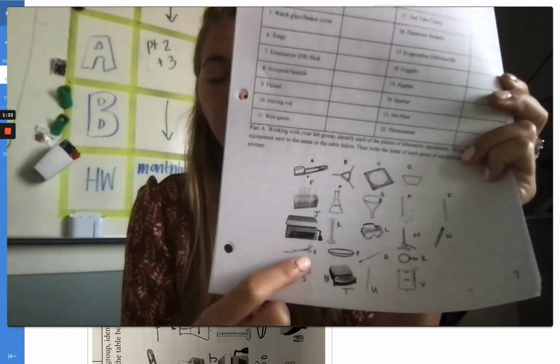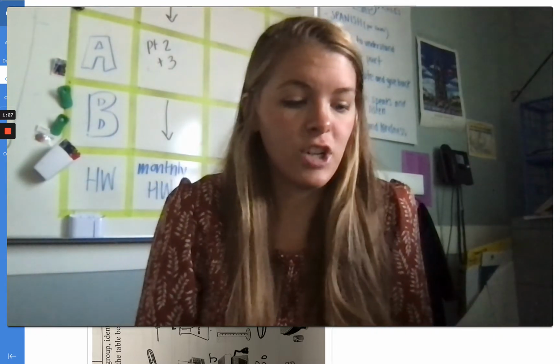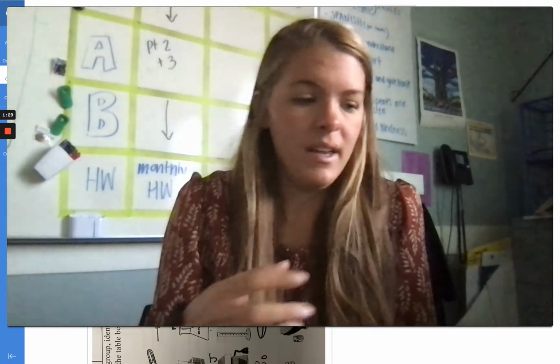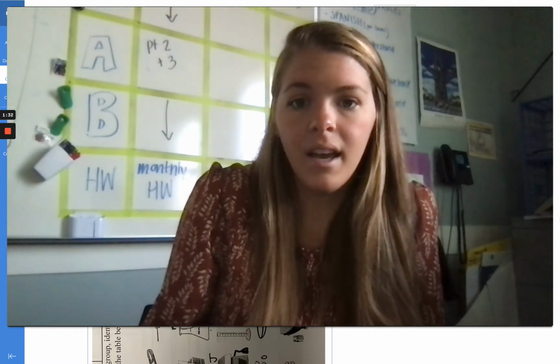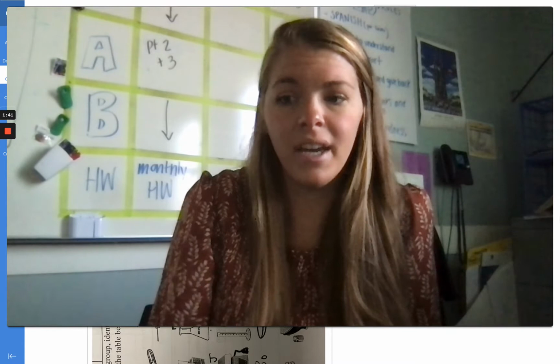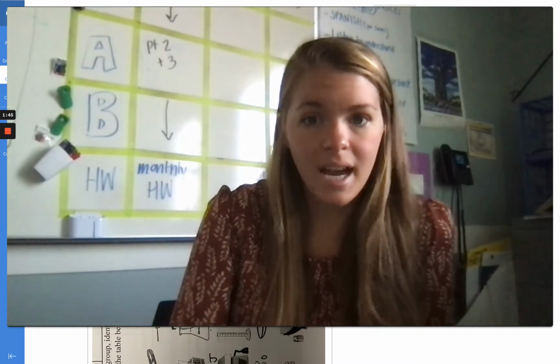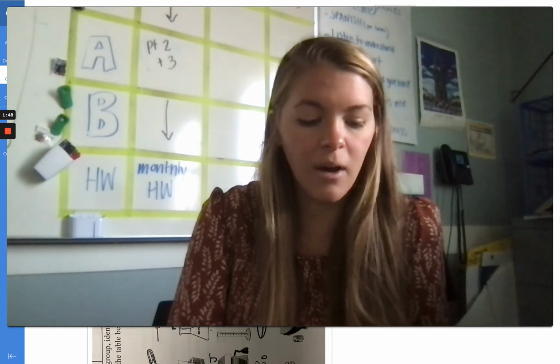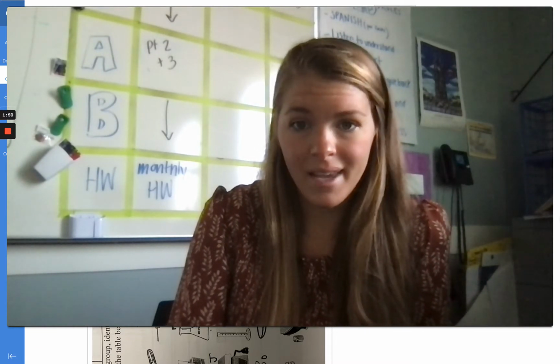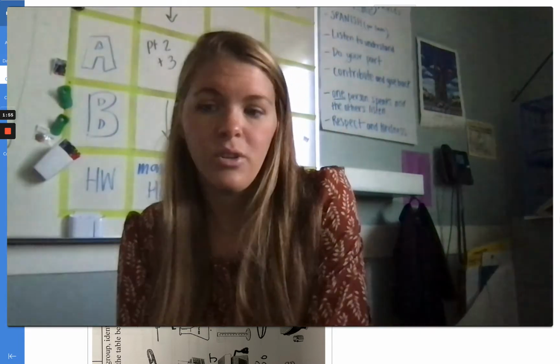So all these pictures down here, you have each of these pieces of equipment in your bin, and your job is to identify which piece of equipment has which name, basically. I want you to try this on your own first and just try your best to see what you know, what you don't know. If you do need to use the internet, then after a little bit, if you can't figure it out, you may. You can also interact with other groups if you are really stuck. So your first task is just to figure out what the name of each piece of equipment is, and we are going to go over this. I'll post an answer key so you can check them out just to make sure you're understanding the names of equipment properly.